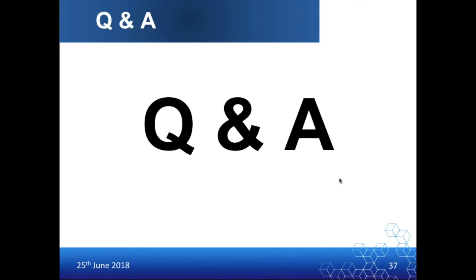Okay, good. A few more questions. I'm really happy that there are so many questions coming. So this question is about the use of the Quasi Vivo system in the model development. Can you comment on how this sped up the model development, because it's about fast track development of the lung immune cell model? How did the use of Quasi Vivo help?